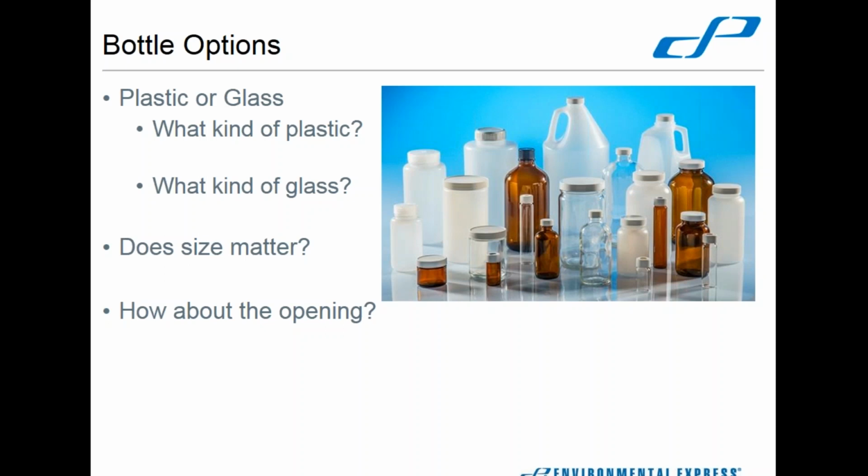So you do need to be aware of what type of plastic you're using or whether you should use plastic or glass. Most of the time, plastic seems to be the preferred container, just because it's lighter weight and it's easier to dispose of after you're done. You can crush it a lot easier, it takes up less space. Lighter weight, obviously, means better shipping costs. So most of the time it's plastic, and then after that it's glass for certain circumstances.